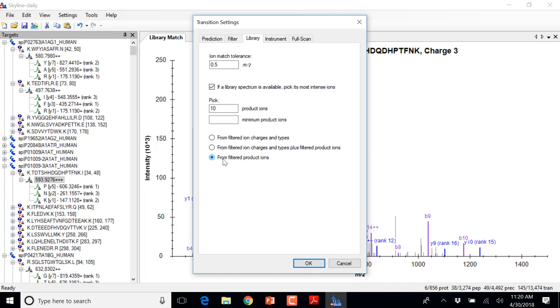Okay. So, after doing this whole exercise, can they save the whole setting in one file? Yep, once you save the Skyline file, these settings are saved with it. So yeah, you can save, and you can even just save the settings.